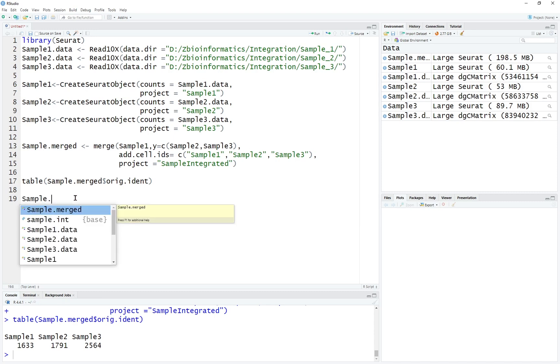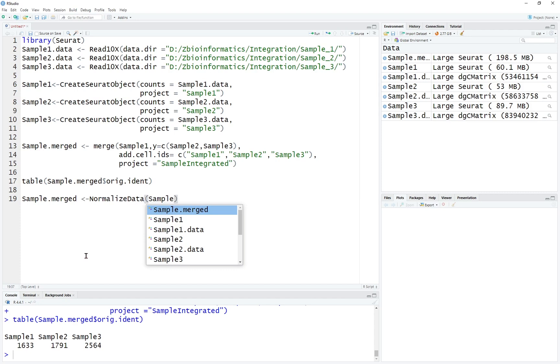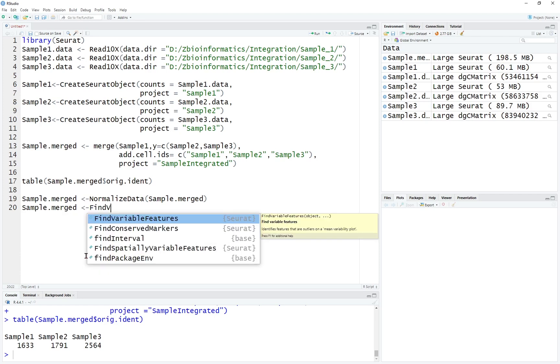So it will be sample merged. We're going to first normalize the data, which is the standard procedure — the preprocessing for all kinds of data. If you don't know how to do the standard processing, you can check the other video for a speed run of all kinds of preprocessing for single-cell sequencing data. After normalization, we're going to find variable features.